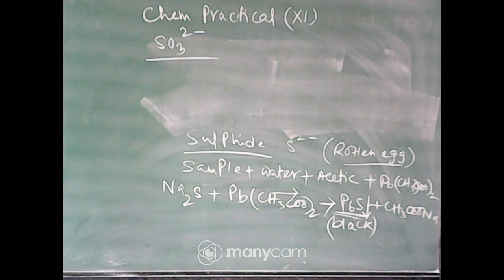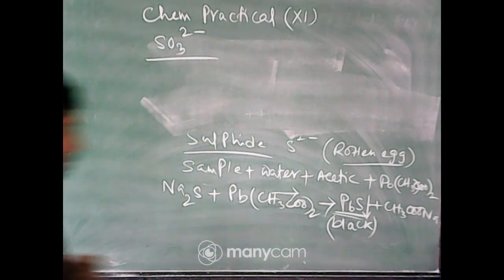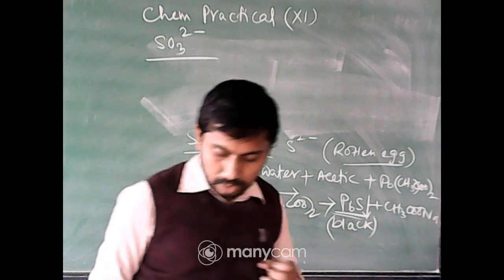Now, acidify it. Acidify it with acetic acid.